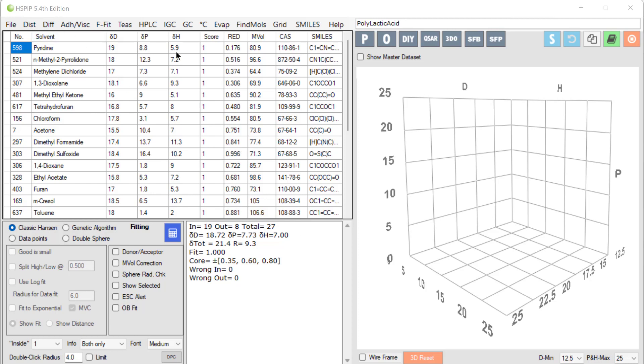In the previous video, we looked at the meaning of the HSP values of the solvents. Now we use those values to measure the HSP of an unknown, in this case a polymer polylactic acid.